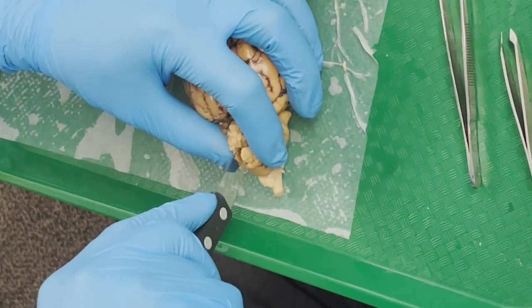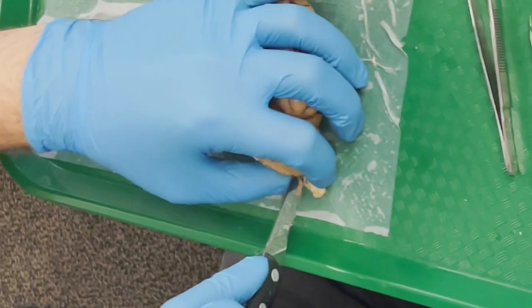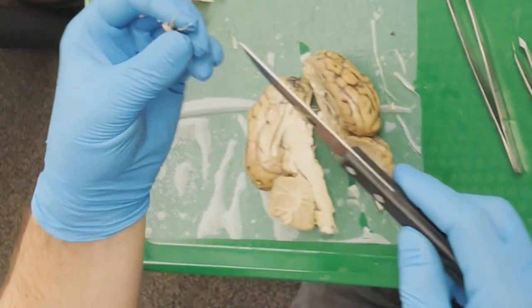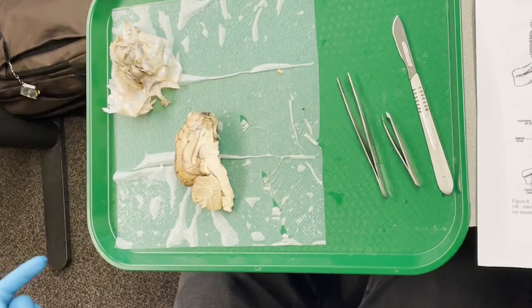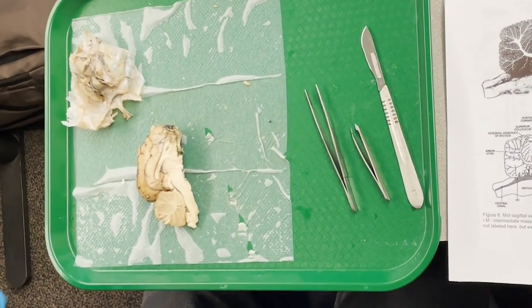And slice it all the way down through the brainstem. Pop! Opened up. And that's a cut, so we'll end that clip there. Midsagittal, because we just divided the hemispheres equally, right in the middle.